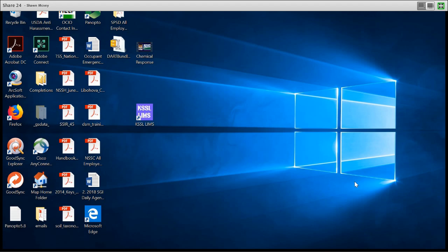You can also access, for projects that aren't complete, and distribute the partial information. The analysis that are completed can be accessed and distributed to the submitters. You also will be able to retrieve and review completed data, request reruns, and then evaluate related data. A lot of the functions that LIMS does you won't need or do. There are some features in LIMS that will be there, but you probably won't be actively using a lot of them associated with the actual operation of the lab.